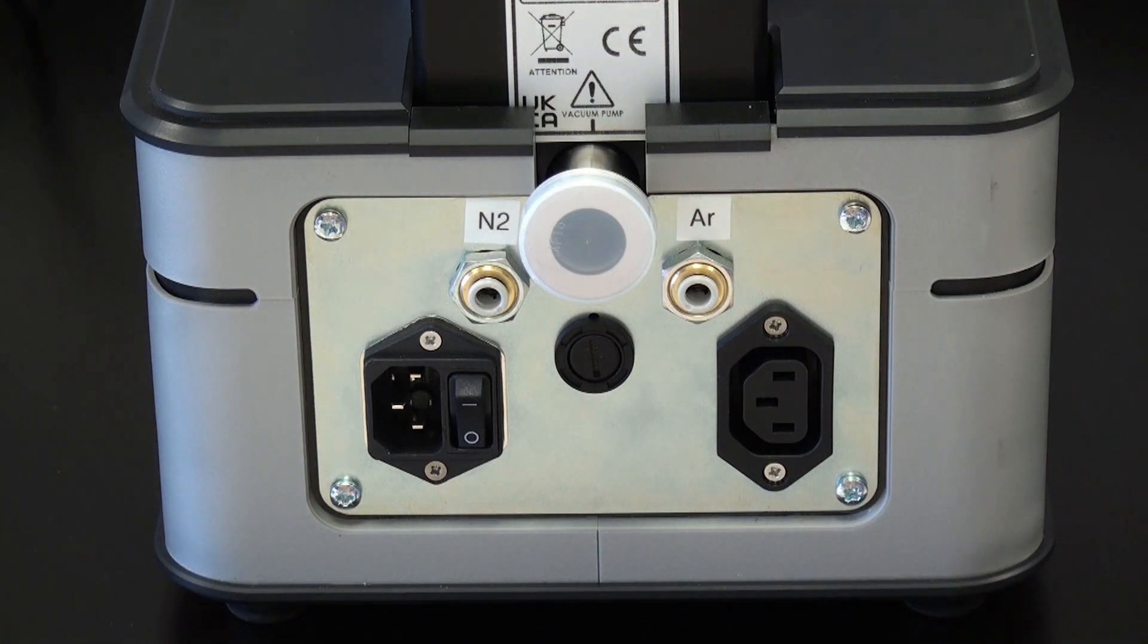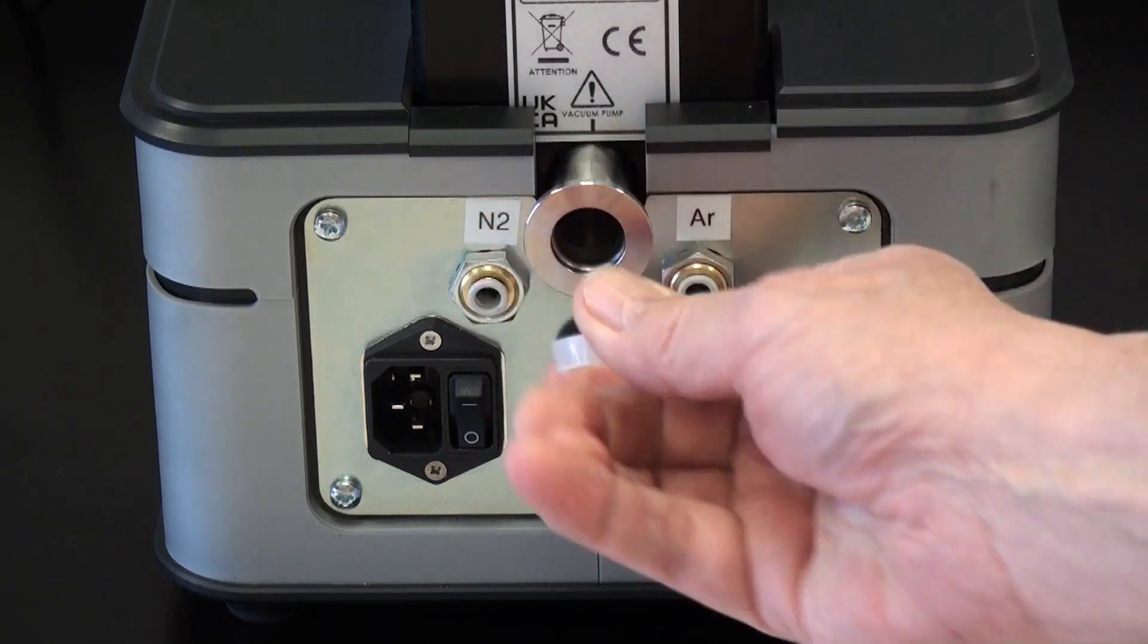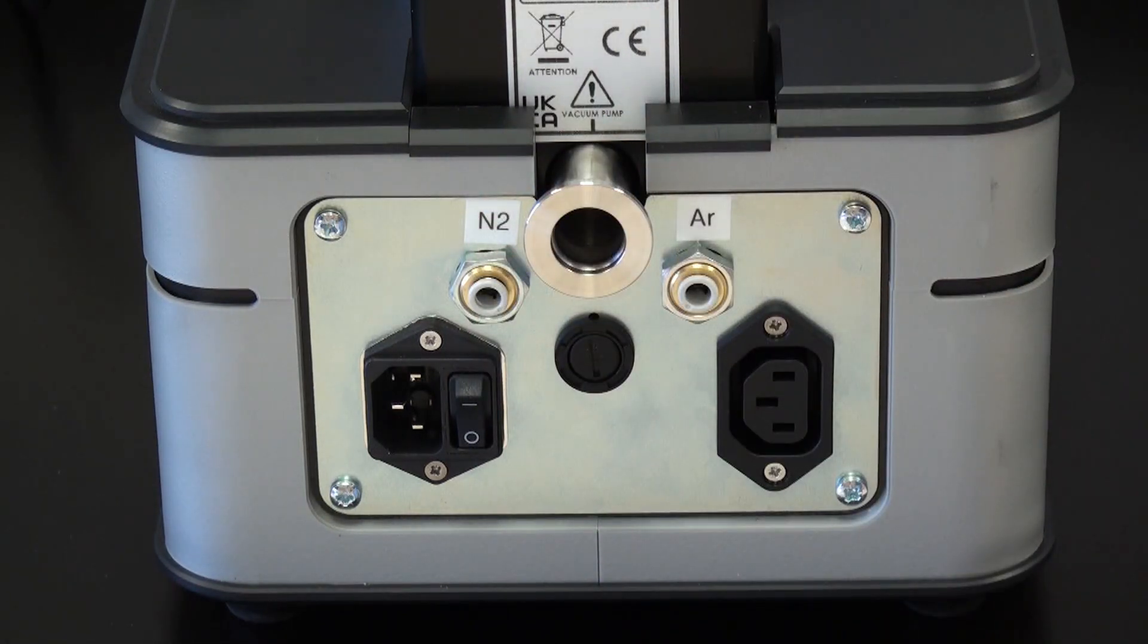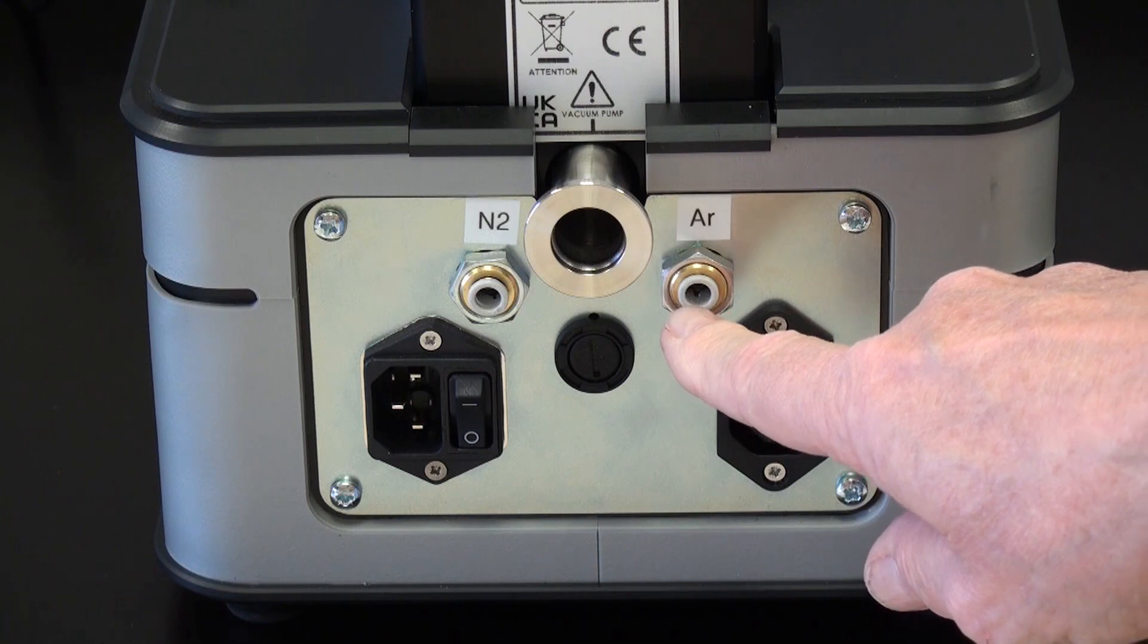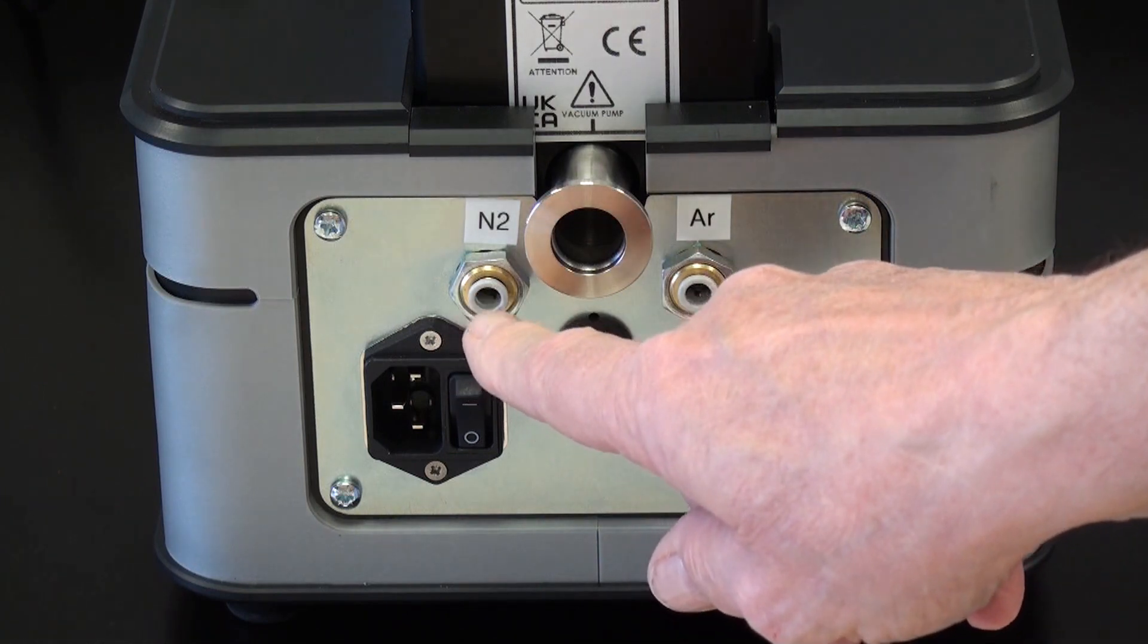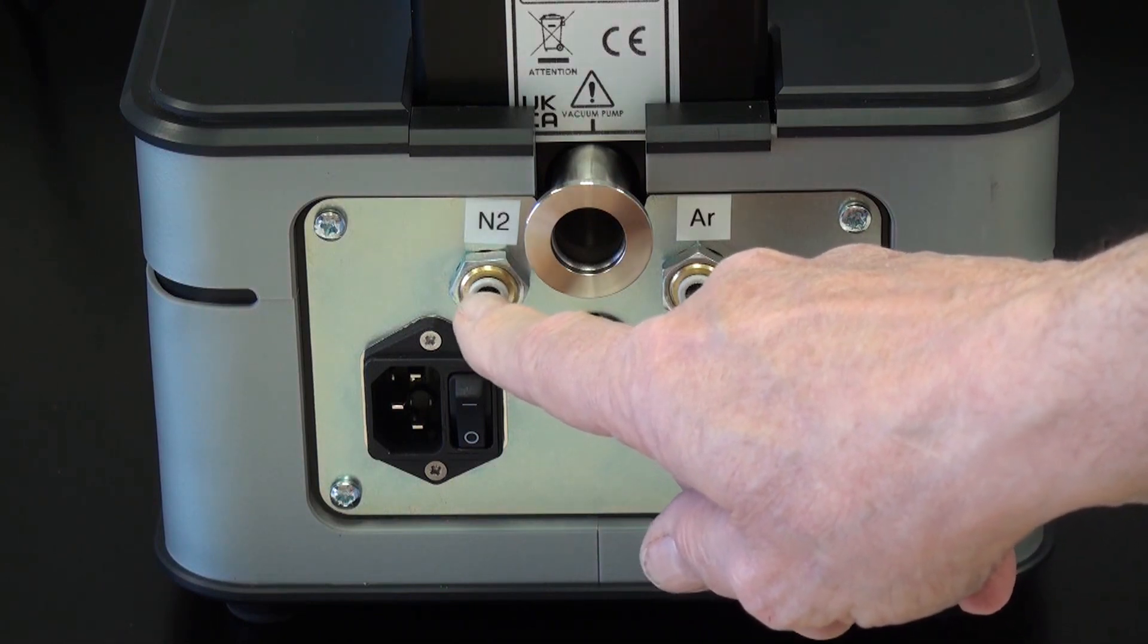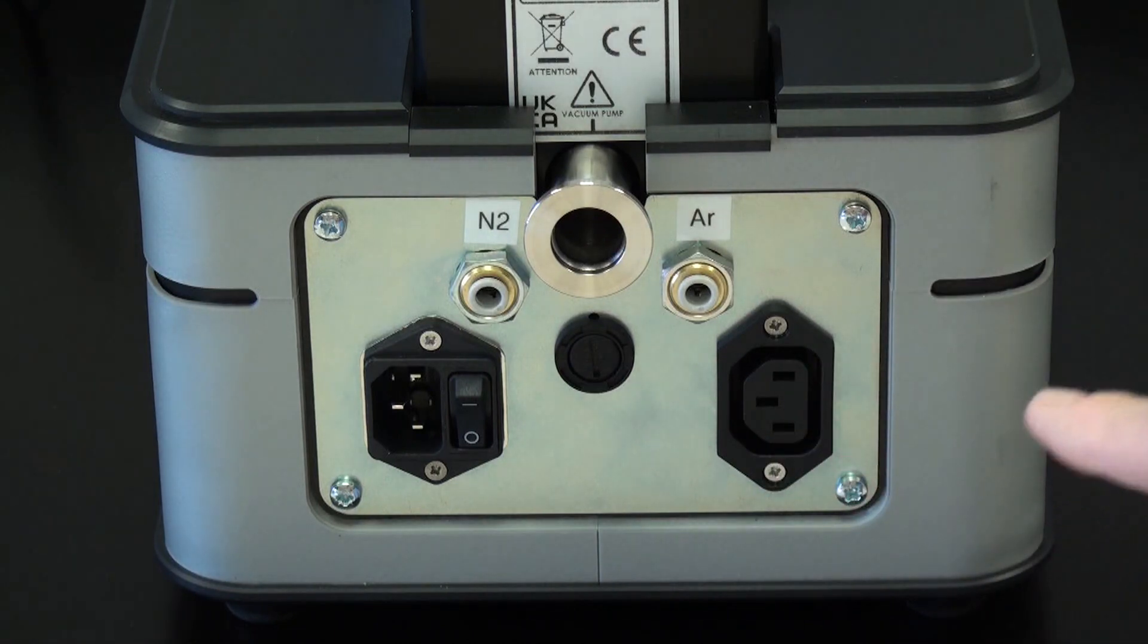On the back of the unit, you can see the connection for the 16KF standard vacuum line which comes with the system. This port is a 6 millimeter push port for the argon tube which is supplied with the instrument, as well as a nitrogen vent line 6 millimeter push tube if you decide to vent the system with nitrogen gas, which I recommend.